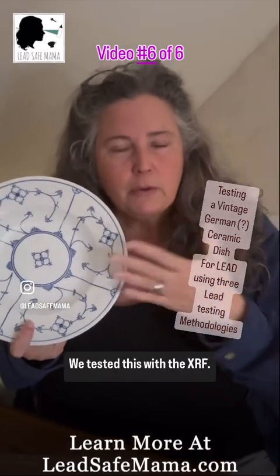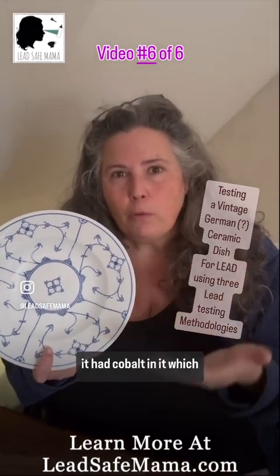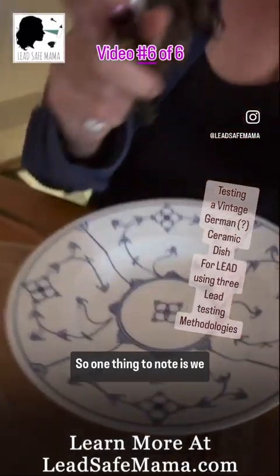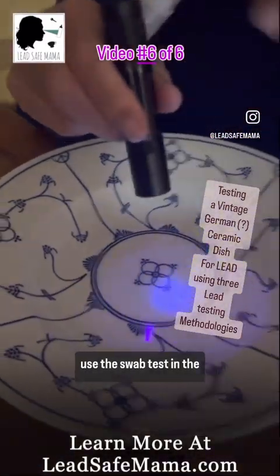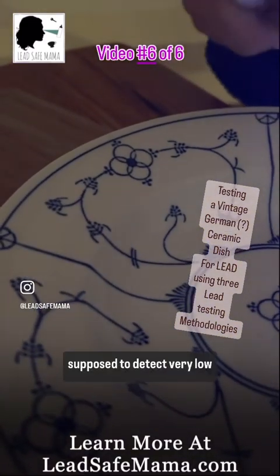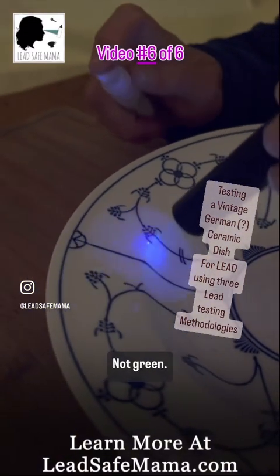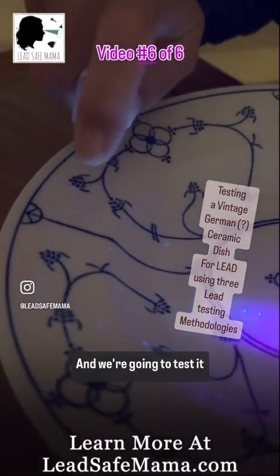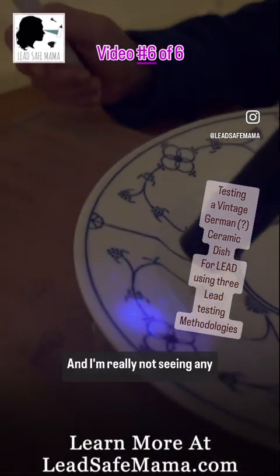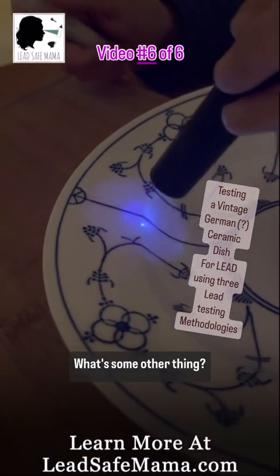We tested this with the XRF — it was low-level lead, like 40 parts per million, and it had cobalt in it, which neither of the home test kits tests for. One thing to note: we used the swab test in the center, so we won't test there for the glowing test kit. The glowing test kit is supposed to detect very low levels of lead. Here we want to see fluorescence — not green. We're going to spray it and see if we come up with any green. I'm really not seeing any green there.